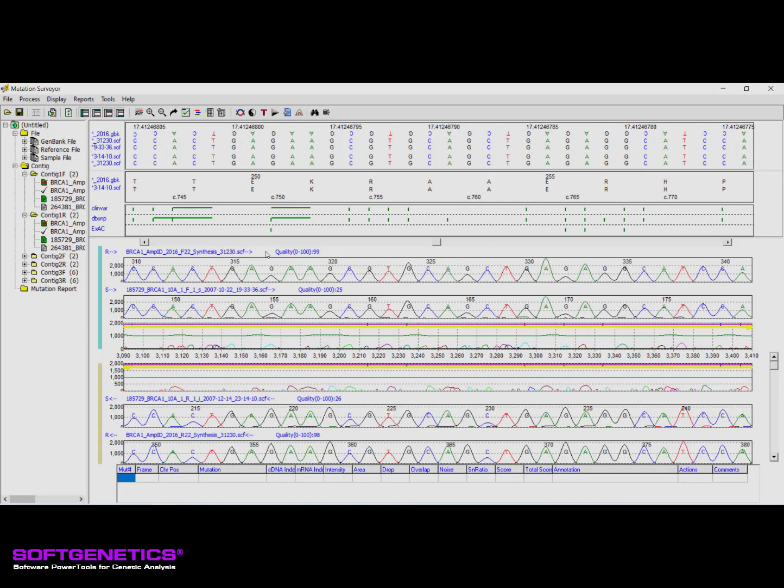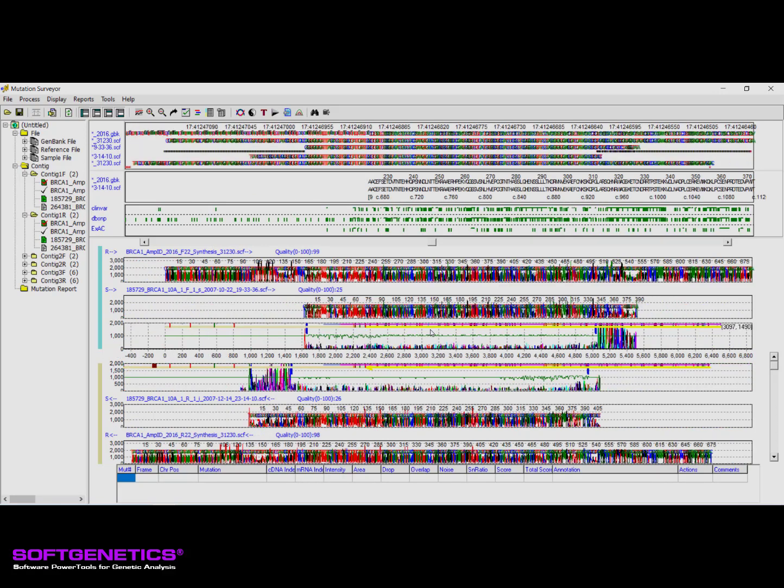The mutation trace displays additional information to help with the review process. To get a better view of the contents of this trace, we can zoom out. Two vertical blue bars are present, which indicate the borders of the comparison region. The comparison region is the portion of the trace the software was able to use for automatic variant detection.